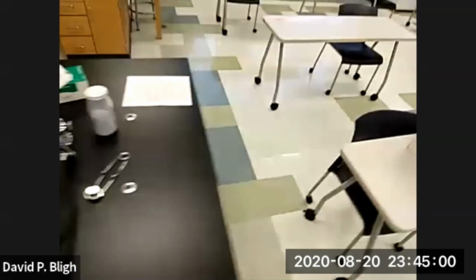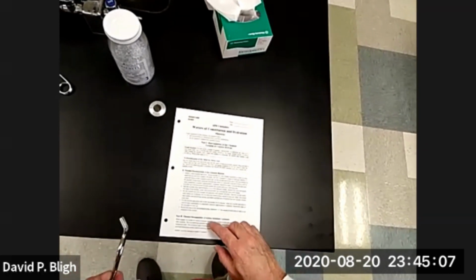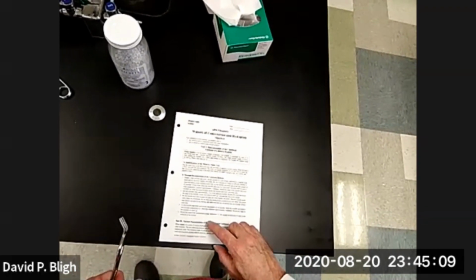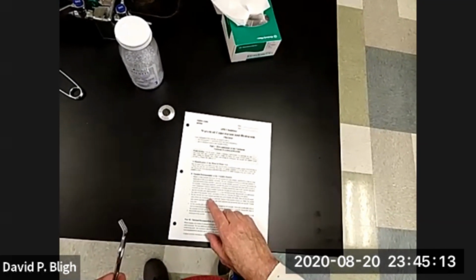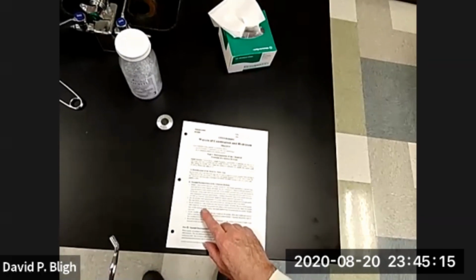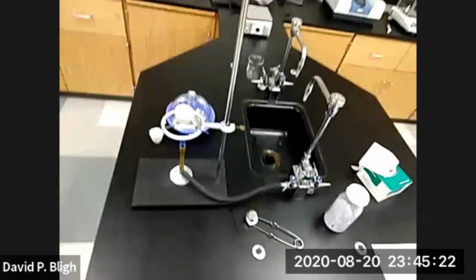And how long are we supposed to heat it? A minimum of, let's see, is it another 5 minutes? 10 minutes. So we're going to go 10 minutes. So 5 minutes till 12, we'll take that one off.